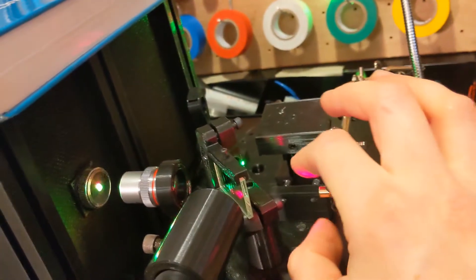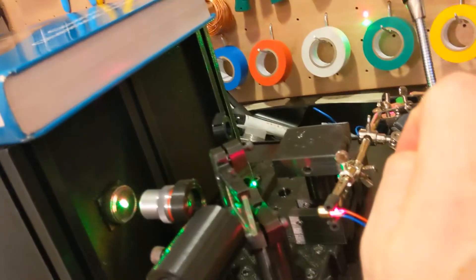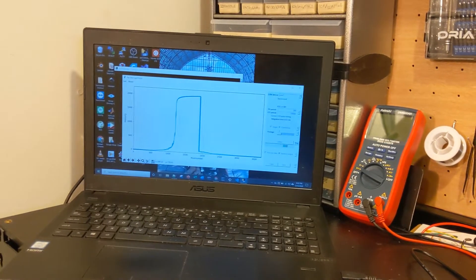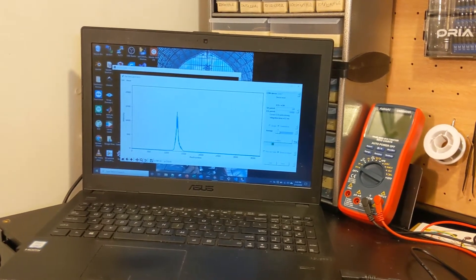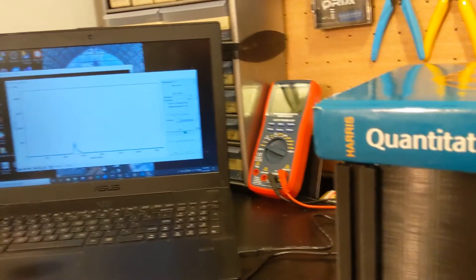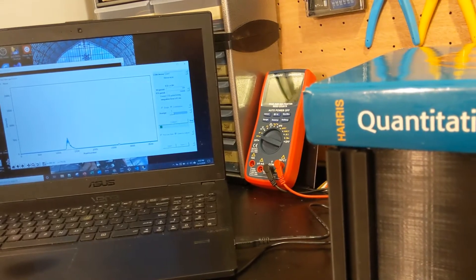You can finely adjust the pointing of the laser with this — I have screws on the back. If you're familiar with the KM100s from Thorlabs, it works in a similar way. Right now I'm fine-tuning the adjustment, and you can see I'm completely oversaturating the CCD. I bumped the red laser so it's not pointing in there anymore, and I'm trying to get it pointing back in.